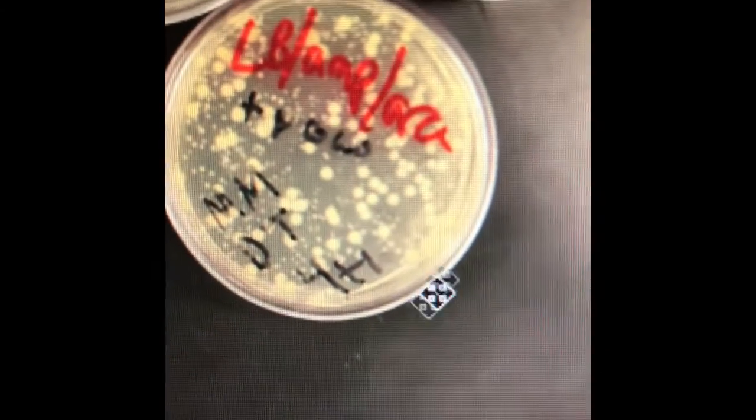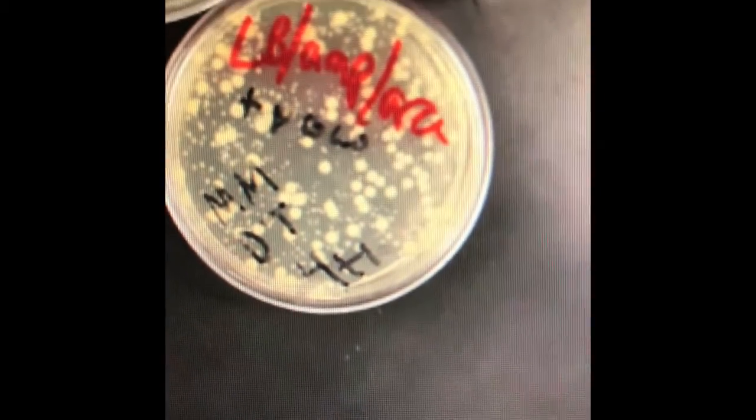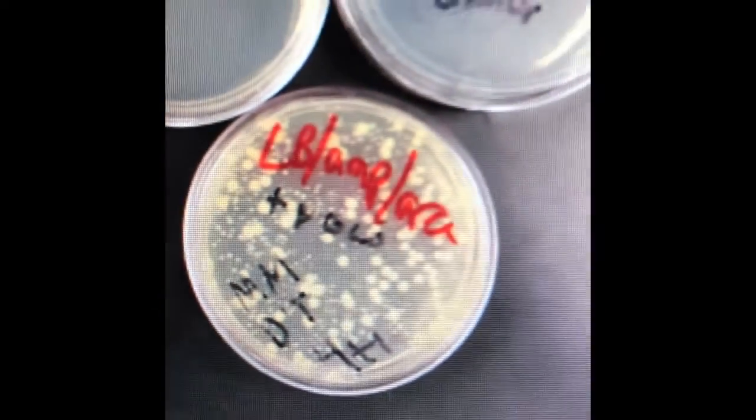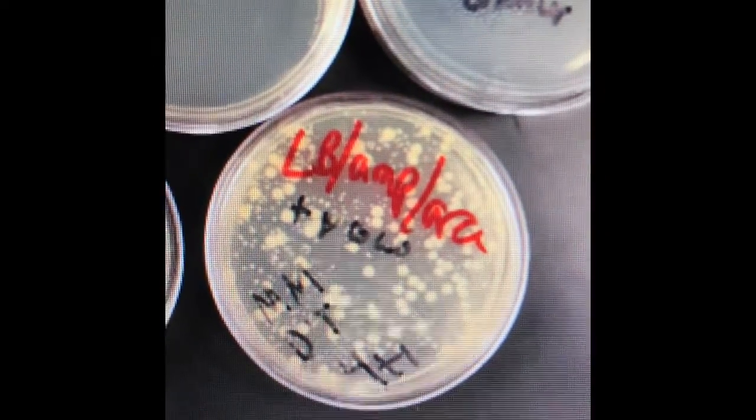Those are the mutated antibiotic resistant colonies, but then on the outskirts of them they grew satellite colonies that did not glow at all.